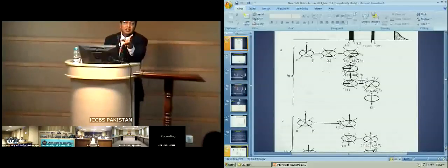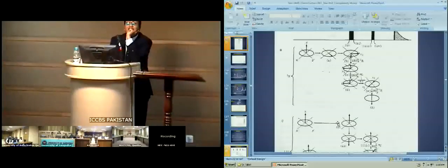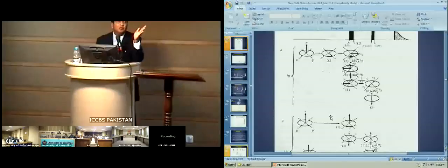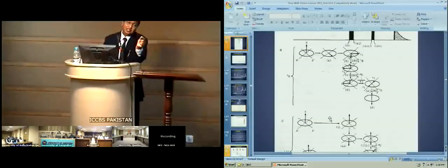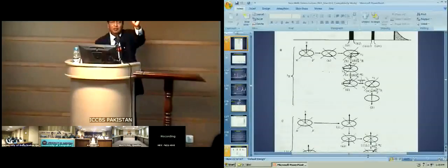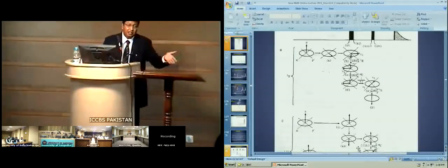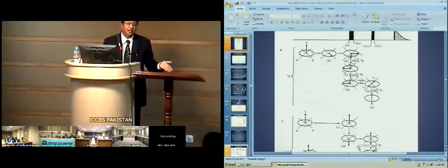SINEPT. What is the advantage? Amazing advantage. Which proton is coupled to which carbon? Without knowing which proton was coupled to which carbon, I just select one proton and do the same thing, and at the end of the day I get an NMR experiment in which only one carbon has increased intensity. Then that is my coupling partner, because population can only be transferred through a direct coupling, right?